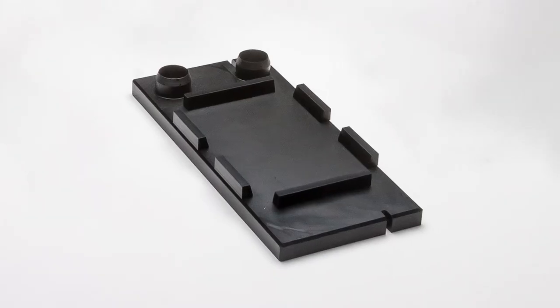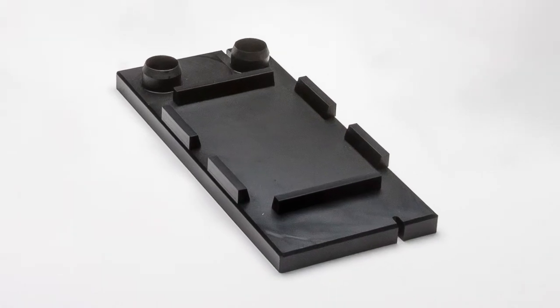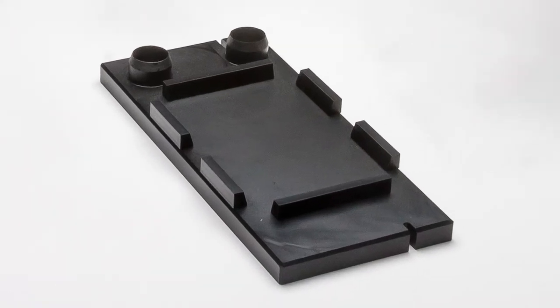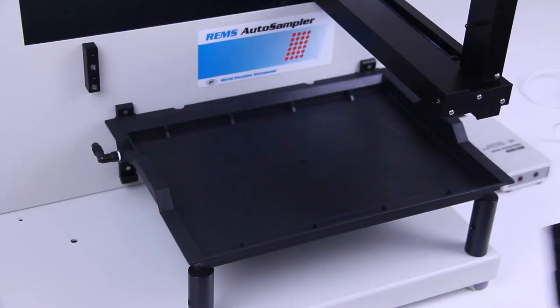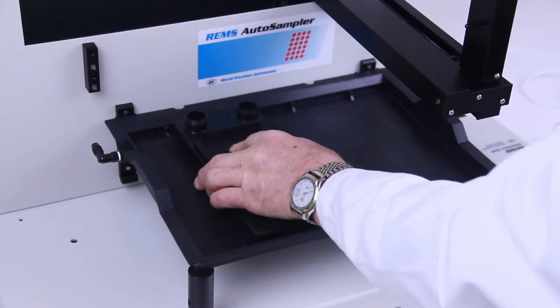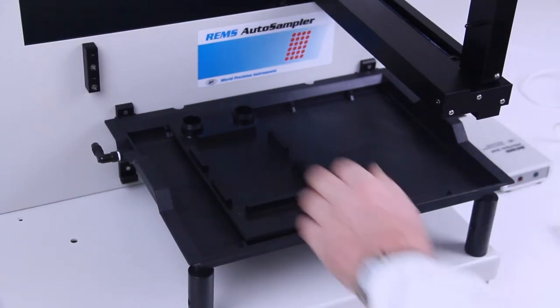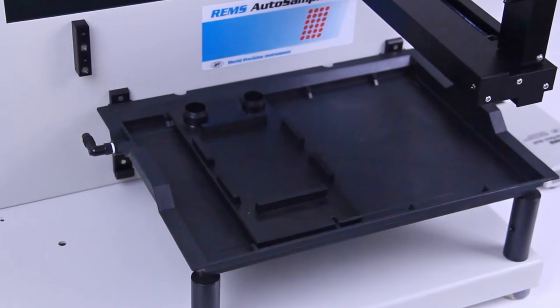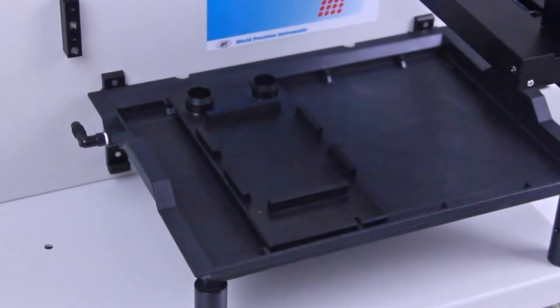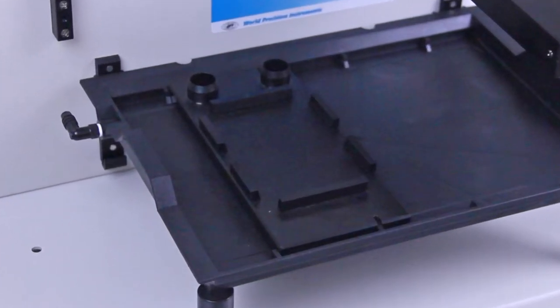The well plate holder secures the well plate. Orient the well plate holder so that the end of the rinsing station is nearest to the front panel of the REMS.